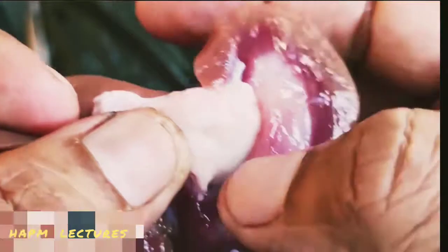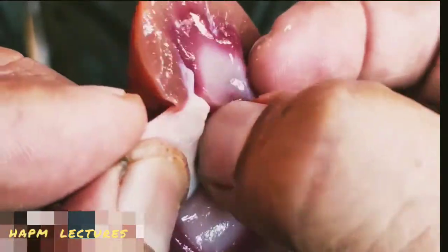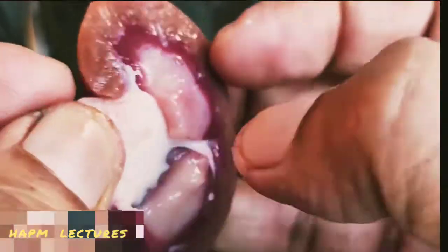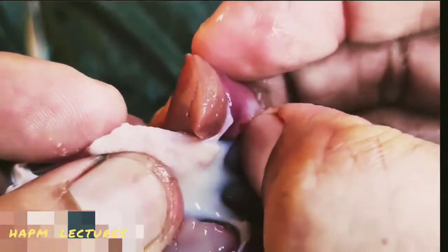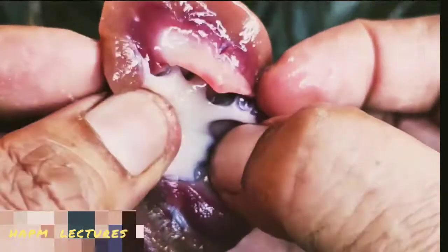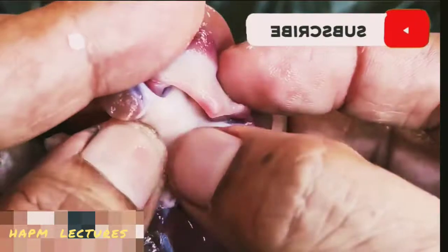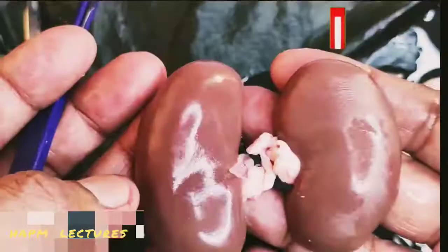Try to open this. You can see how the inner structure is. Yes, you can easily see the inner renal papillae also. You can observe how the structure opens into the minor calyx and then forms the major calyx, which unites to form the renal pelvis. You can get a clear idea of the structure. See how these two halves are now separated.